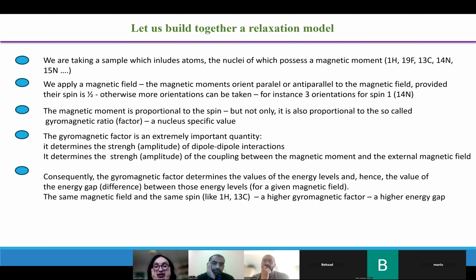Because proton has a magnetic moment, and depending on the composition of the nucleus and some quantum physics rules, the magnetic moments of the protons which build the nucleus sum up in different ways, and consequently, some other nuclei also have magnetic moments. And they can also be used for NMR. So you already learned something.